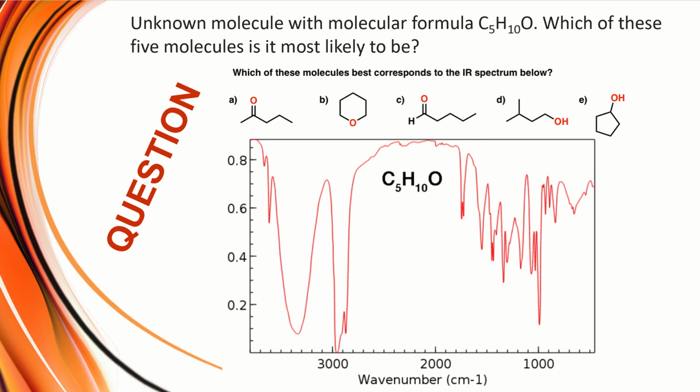All right, so you analyze the spectrum, right? You're going to need your table and you're going to need your molecular formula to look for the peaks, right? So you're going to look at the functional groups of the various compounds and see which one matches and which one does not match this spectrum here. So we'll answer this one in class.